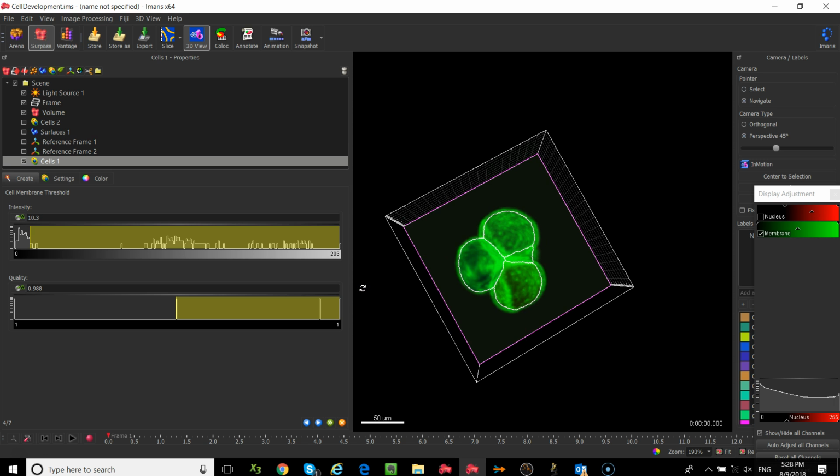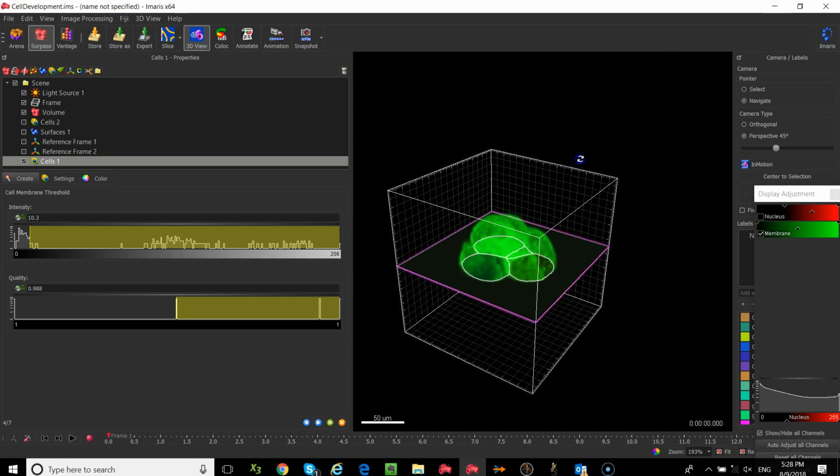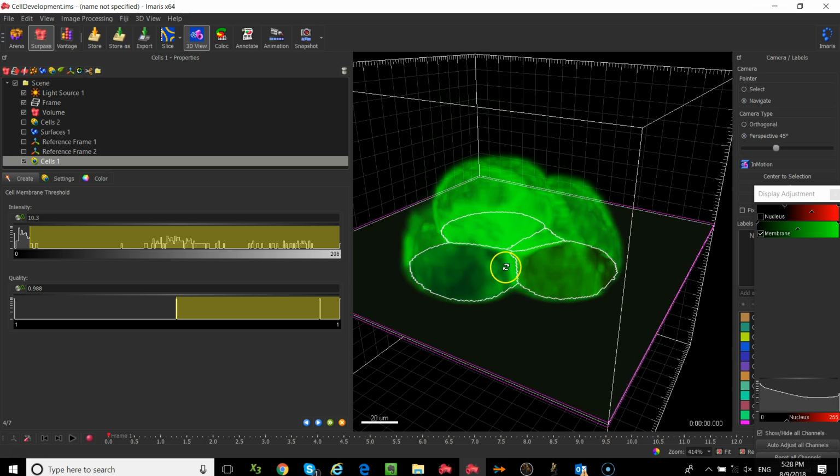Okay. So what I want to show you is the first view that you're going to see, which is a slice through. Membrane detection is a tough one because you want to be able to see that it segmented correctly, and if you just see it in a 3D volume, you're not going to see that so easily. So we use something called a slicer display. What you're looking at is the 3D volume, and these little white lines are representing the boundary, or where the membrane is. Okay?